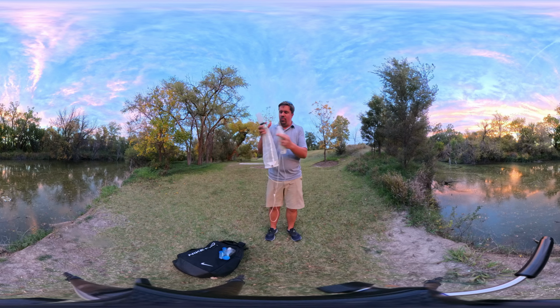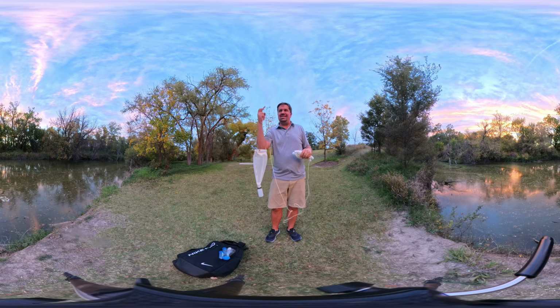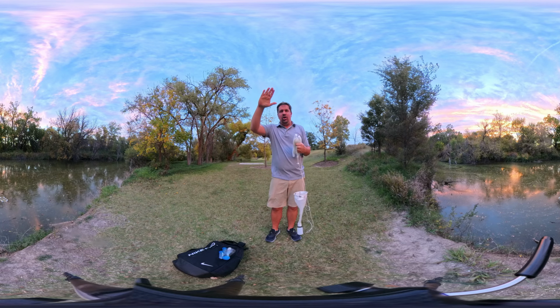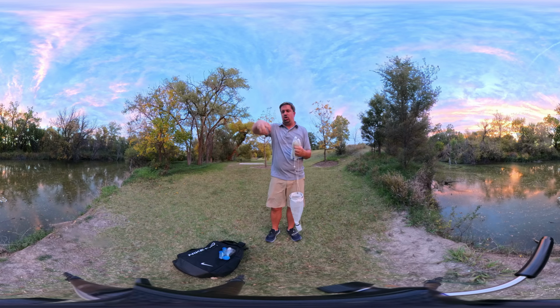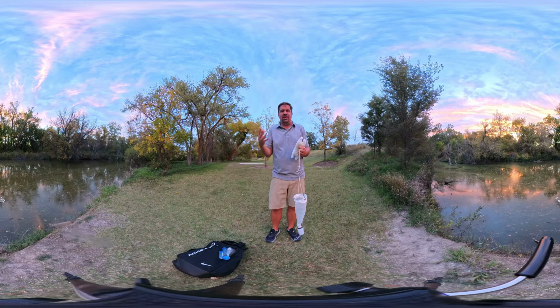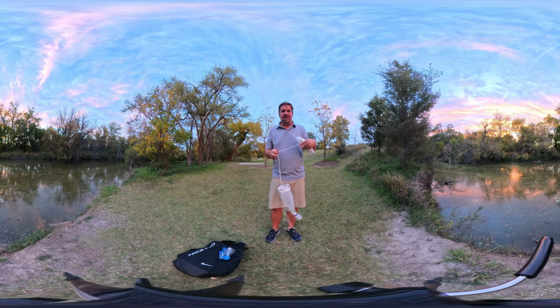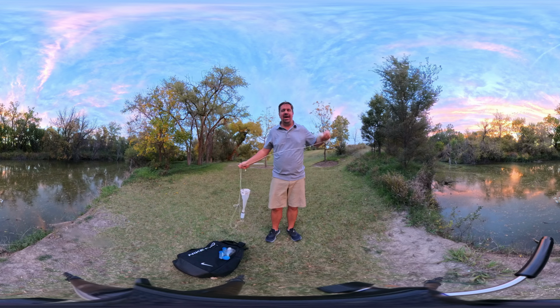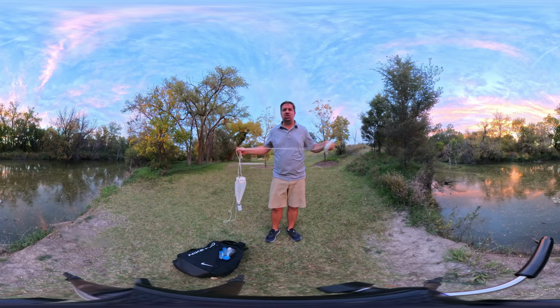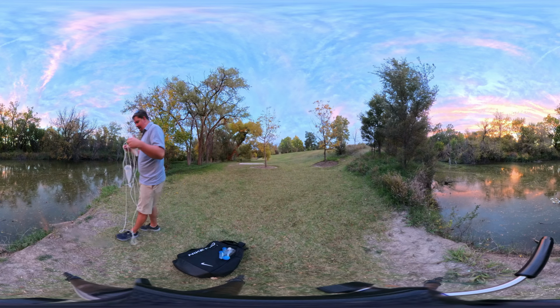When you collect them with these algae nets, it's important to make sure that you stay on the surface of the water. Don't let the algae net sink all the way to the floor and scoop up some of the sediment, some of the soil, because that will not help the cyanobacterial growth. Instead, what you want is just the surface. So let's see how well I am doing this.